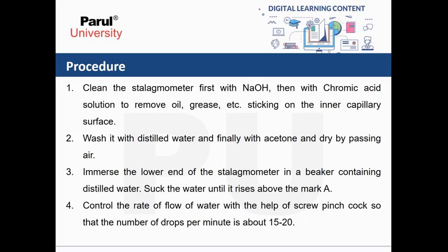Procedure: clean the stalagmometer first with NaOH, then with chromic acid solution to remove oil, grease, etc. sticking on the inner capillary surface. Wash it with distilled water and finally with acetone and dry by passing air.